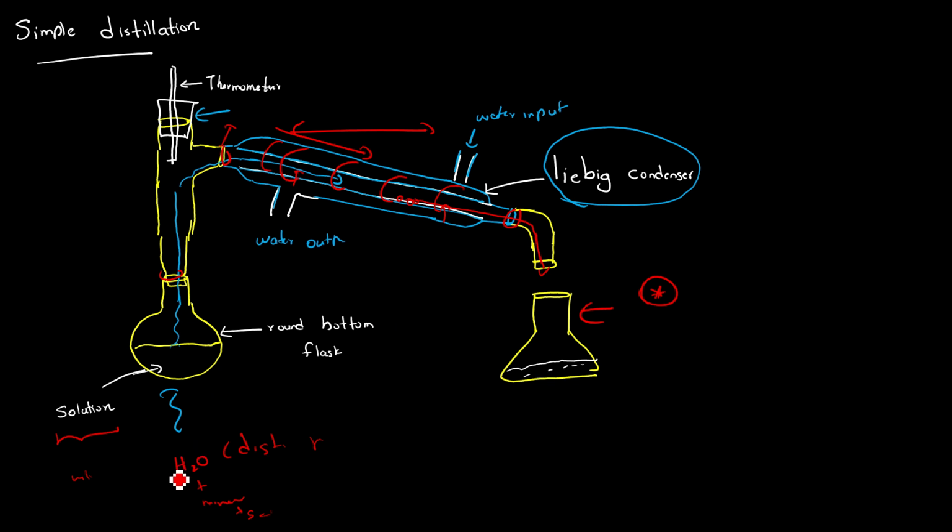What happens is these minerals have a very high boiling point, so they won't vaporize. Only the water, at 100 Celsius, will vaporize.